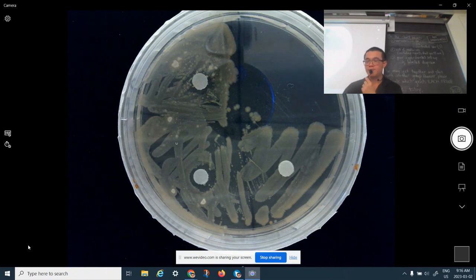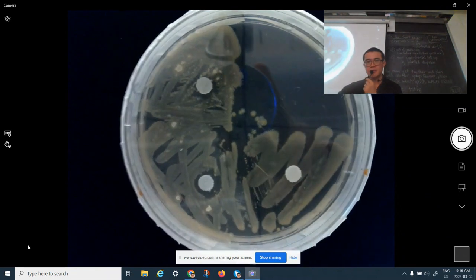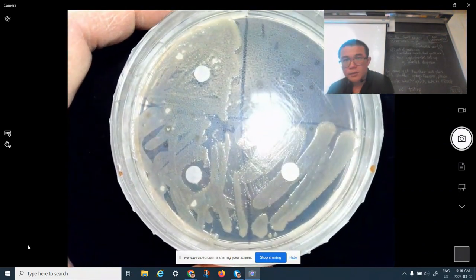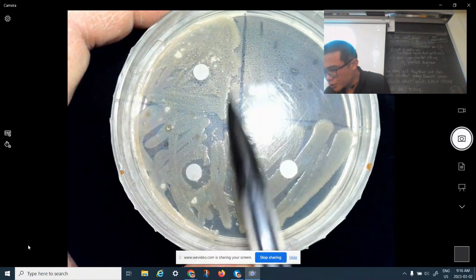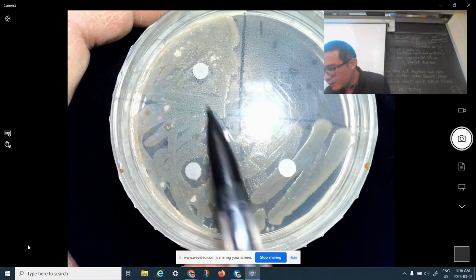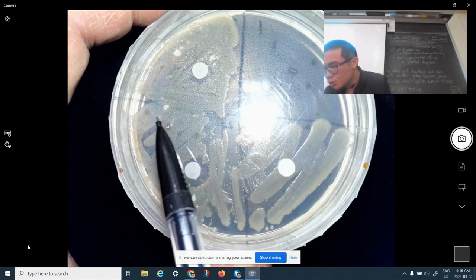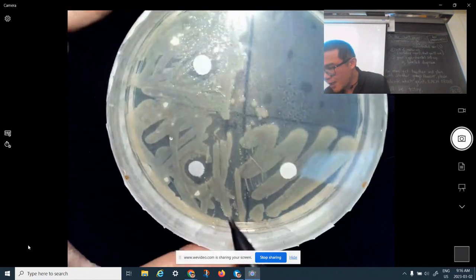If there's anything that stands out very differently, so in this group's plates, all these background ones, the yellowish kind, are the same type, but you do have little chunks here that are really white dots and the edge is somewhat irregular. You would want to note that, you would want to comment on that.